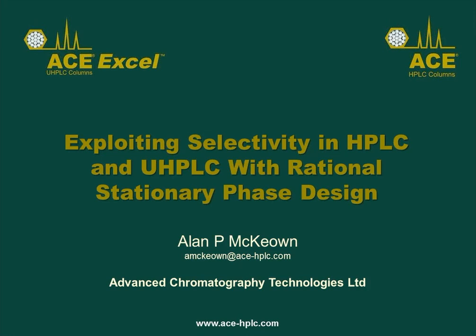Okay, thank you, Nick, for the kind introduction, and welcome to everybody to this webinar. My name is Alan, and I work for ACT, who make the ACE range of HPLC and UHPLC products. Today's seminar is on exploiting selectivity and the importance of selectivity in HPLC and UHPLC, and also today's seminar will give you a bit of an understanding into how we design stationary phases.